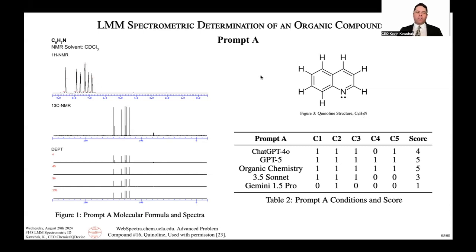Now the carbon skeleton here. Based on what you're seeing on this recorded version, in the high-res image you can see some of the splitting types, basically the multiplicity of it all. If we look at the C13, we can quickly spot the chloroform at about 77. Then we start counting: 1, 2, 3, 4, 5, 6, 7, 8. There may have been some overlap with this. That was the only thing that wasn't clear to me.